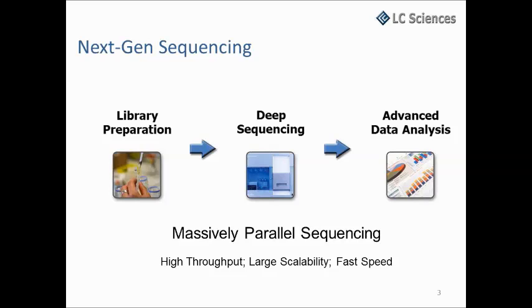With parallel sequencing, we have a high throughput, and it can go to very large scalability, and considering how many reads we get in a few days, it's a very fast speed.